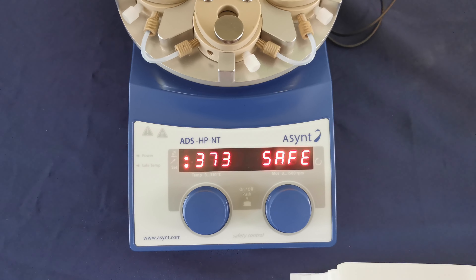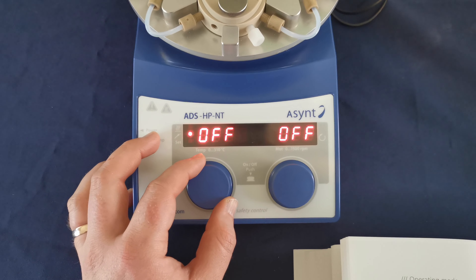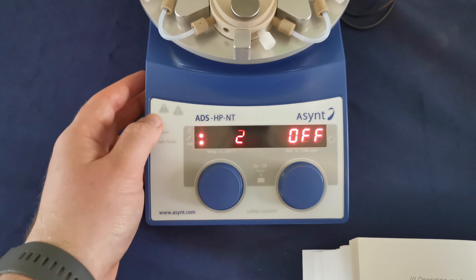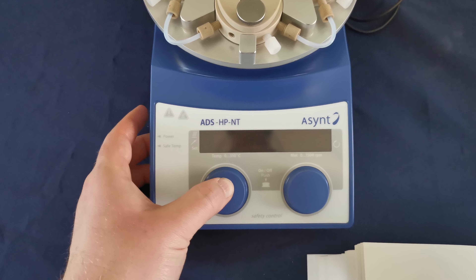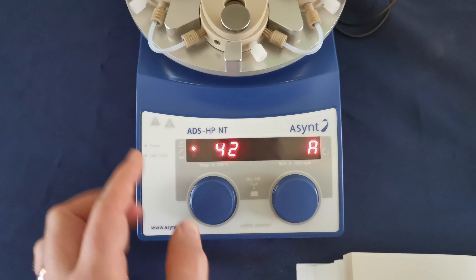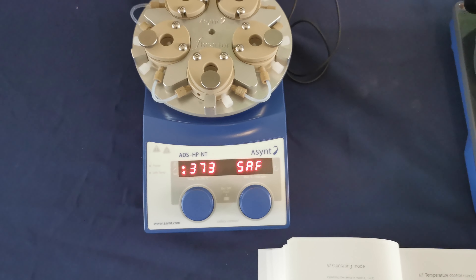And to reverse that, you simply need to repeat the process. Set it to 2 degrees, turn off the hotplate, hold down, turn it on, and you'll see that 2P has now disappeared, which means that the hotplate is in PID mode.